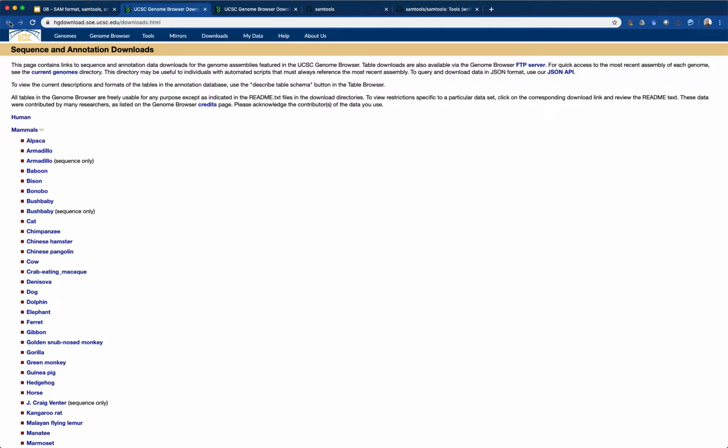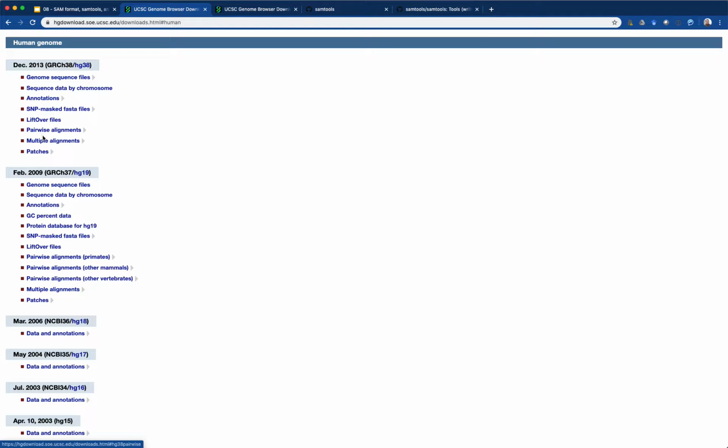So if we go back, oh, I blew it. If we go to human, you can see that it's organized by builds. So what I was using was build 38 of the human genome. Here's a problem in human genomics and really genomics for every organism.